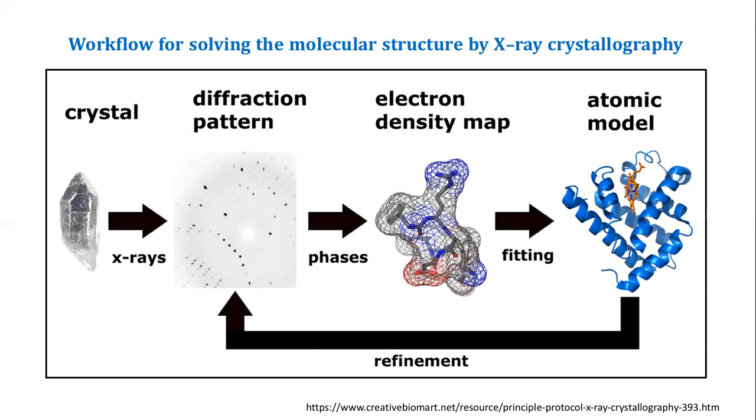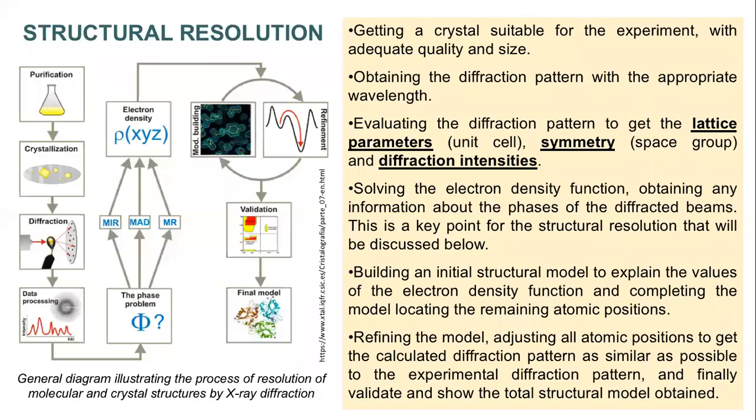So this is very, very significant as far as the drug development industry is concerned, where we are using structure-based drug designing. X-ray crystallography has become one of the most trustworthy techniques which can be adopted for designing drugs based on structure, because structure is very important: how molecules interact with each other, especially in pharmaceuticals, how the drug molecule interacts with the target molecule, is all dependent on the structure of both. So this, in a nutshell, shows the process of resolution of molecular and crystalline structure by X-ray diffraction.